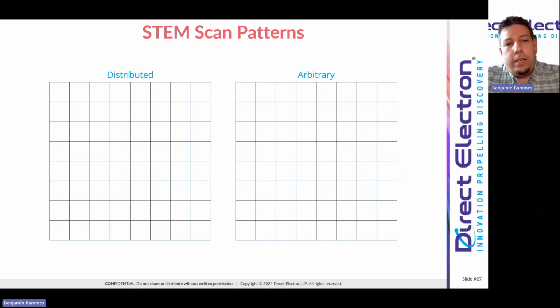And finally, you may say, well, I have my own idea for a scan. I want to do something completely different. And so I want to design my own scan patterns completely arbitrary. And so you might design a smiley face scan pattern like this. I have no idea why this would be scientifically useful, but it was fun to draw nonetheless. So you have all of these potential scan patterns that have been proposed or that you might imagine.